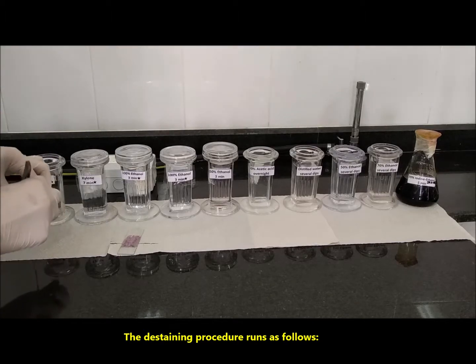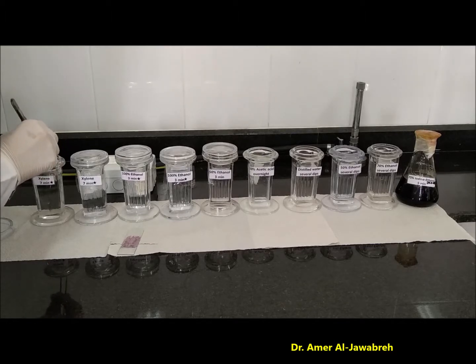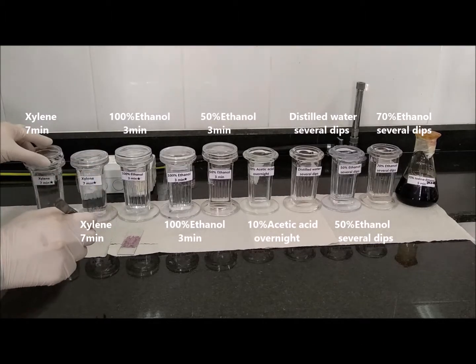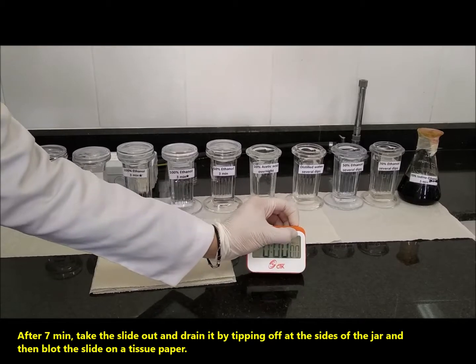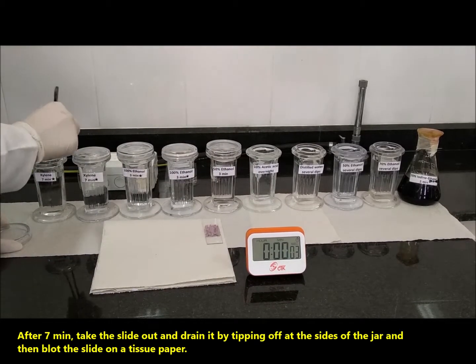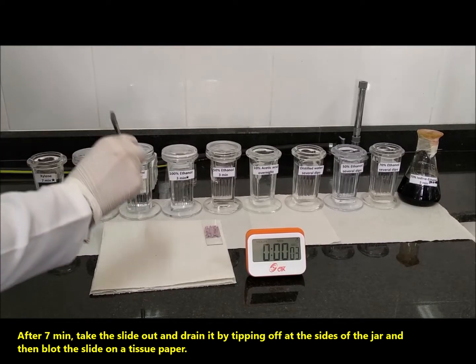Put the slide in xylene for 7 minutes. After 7 minutes, take the slide out and drain it by tipping off at the sides of the jar, and then load the slide on a tissue paper.